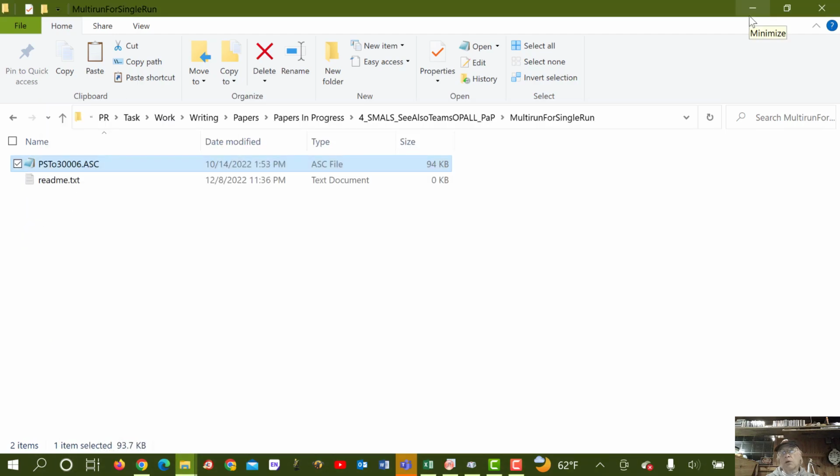Hello, Paul Russo here, and I'm going to use this video to demonstrate the use of the MultiRun program when you want just a single run. Normally, if you have just a single run, it's because you have a nice quiet sample and you just collect the data, run it through the ALV, which automatically generates your cumulants output.